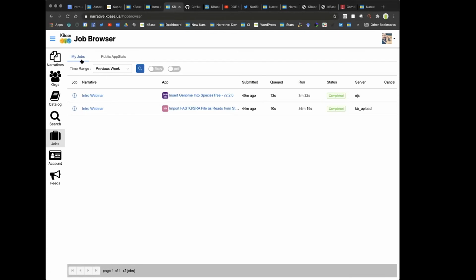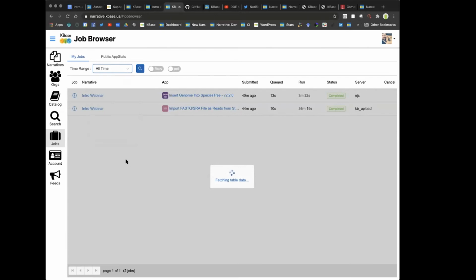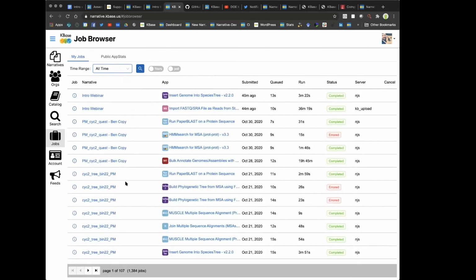So you can see my jobs here. Not too much going on in the previous week for me, but you can go back through all time, for instance, and see all of the jobs you've ever ran on KBase. Basically, as you start to build more and more narratives, and you might have multiple narratives where you're running several jobs per narrative, it can start to get a little challenging to remember which tab you had open and stuff like that.